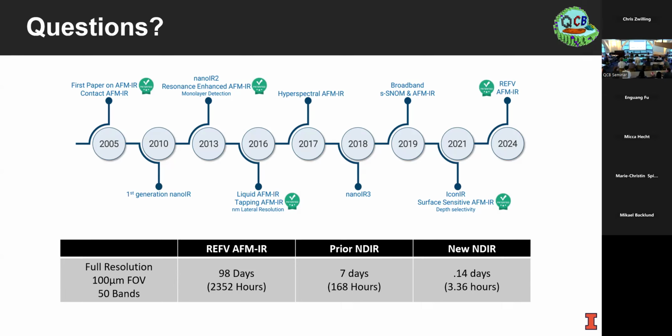It's really important to snapshot the spectra at each pixel. That goes back to your question: you do these bands separated in 3 hours, but can you really image register them down to nanometer length scales everywhere in the image? I don't know if the image registration will be that good if we ever push the resolution limits down.